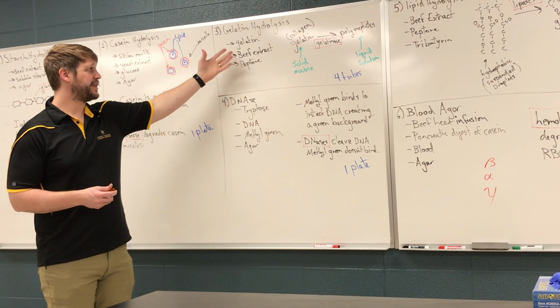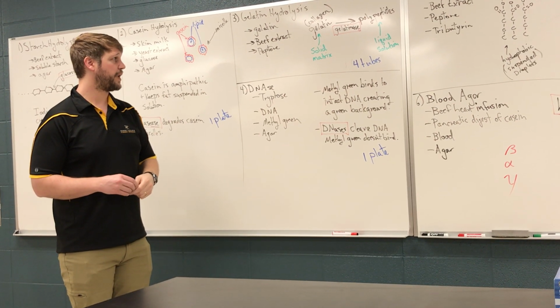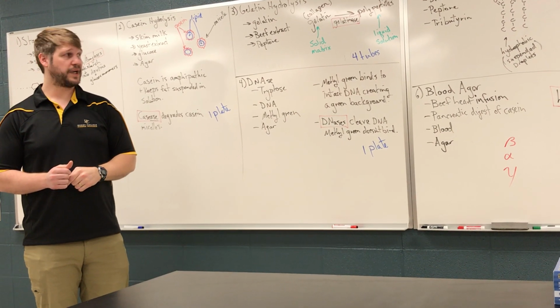In there, besides the gelatin, are just a couple things to help support the growth of the organism: beef extract and some peptone. But fairly straightforward stuff.